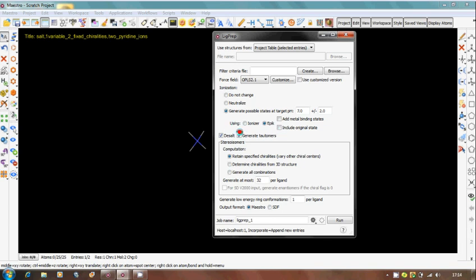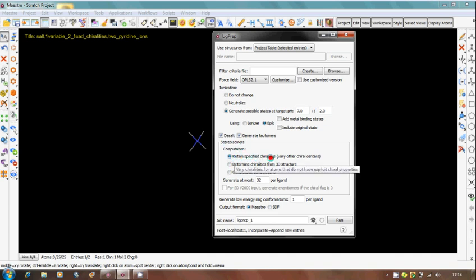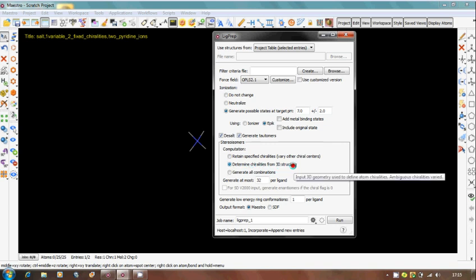Next one is stereoisomeric centers. What are stereoisomers? Whatever the molecules you have sketched, if you have any isomeric forms, you can go for retain specified chiral centers or determine chiralities from 3D structure. What does it mean? Whatever the molecule is there, once your 2D molecule is converted into 3D by Maestro, it itself generates some chiralities in the molecules and various chiral centers.